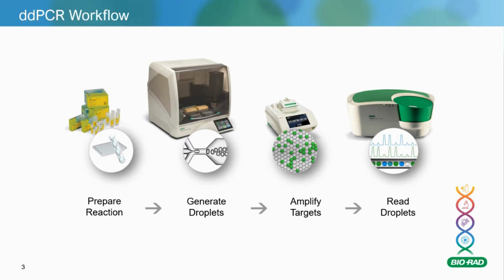So the workflow should be semi-familiar to anyone that's doing any sort of PCR. The only difference is that you're doing a droplet generation step. That droplet generation step takes each well of your 96 well plate and divides it into around 20,000 partitions per well. What that means is your reaction is divided up so that PCR occurs on each single droplet. So I like to think of it as having 20,000 PCRs occurring instead of just one in each well.